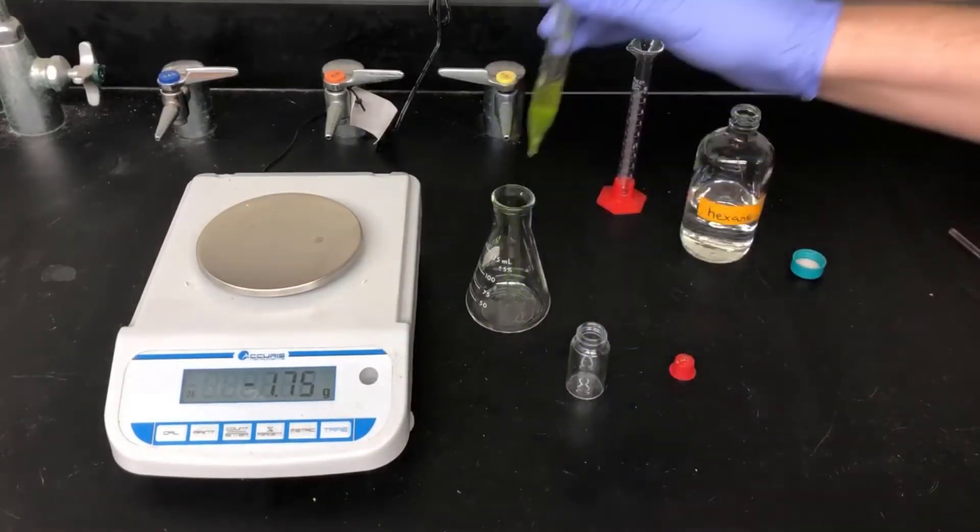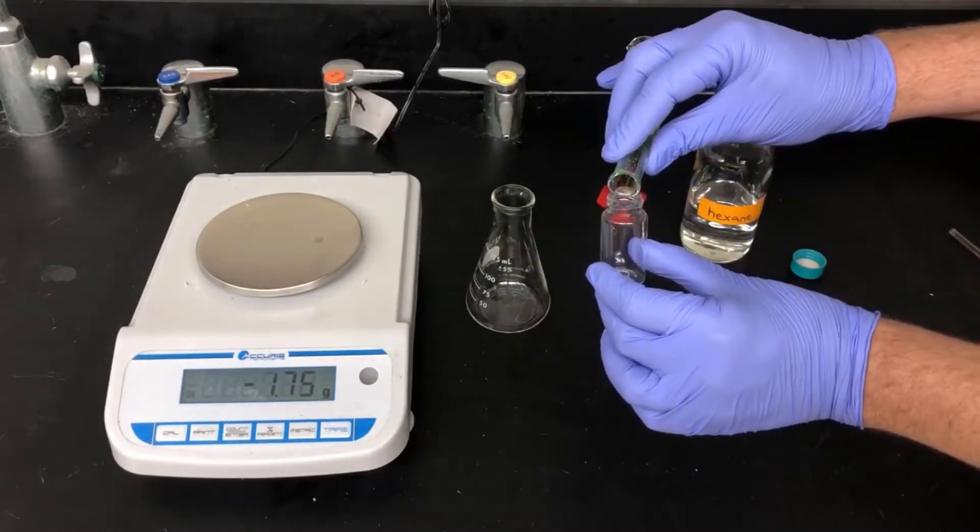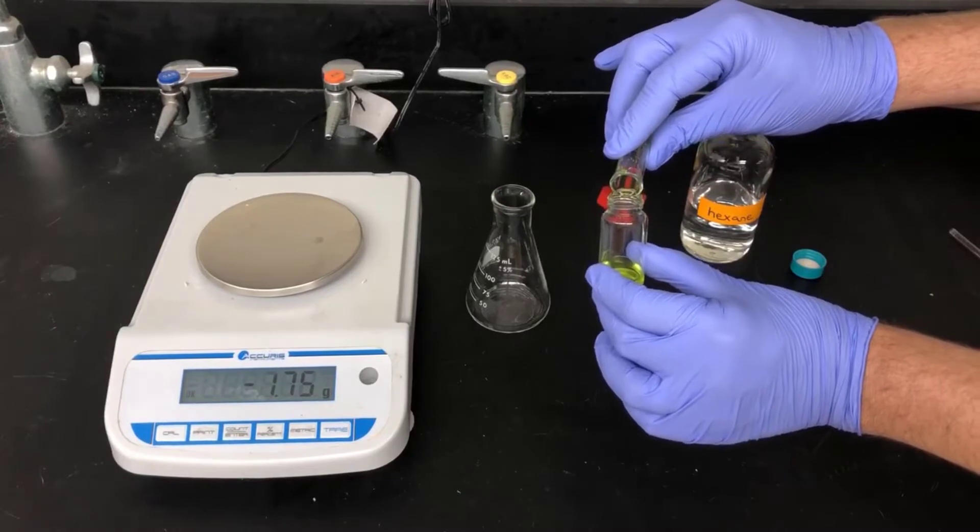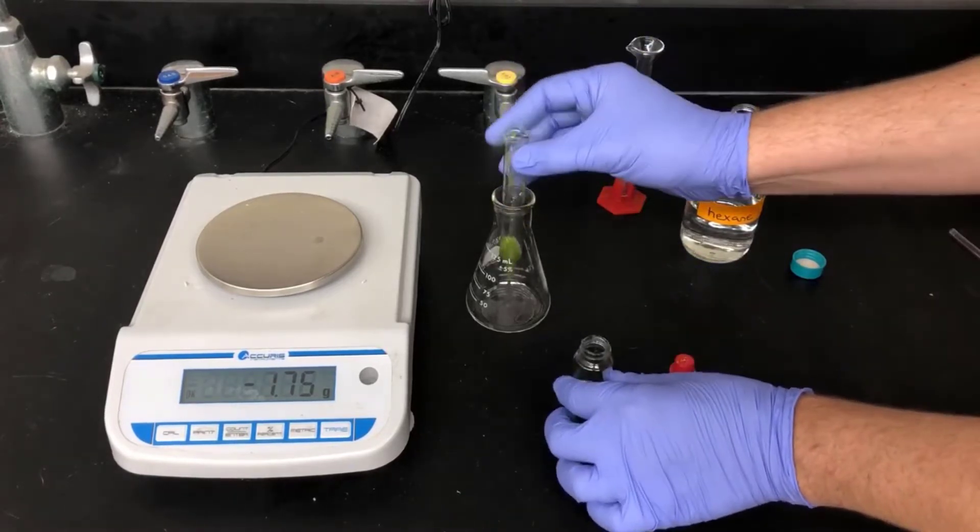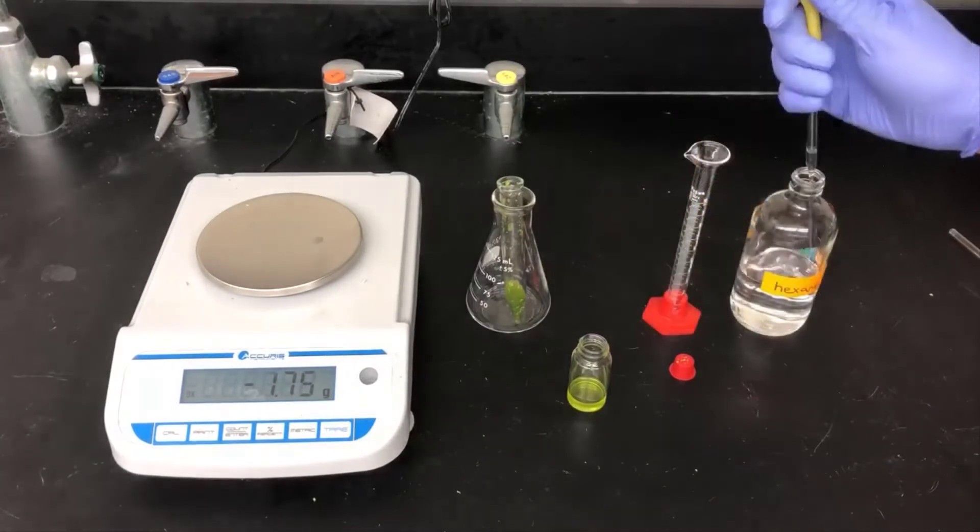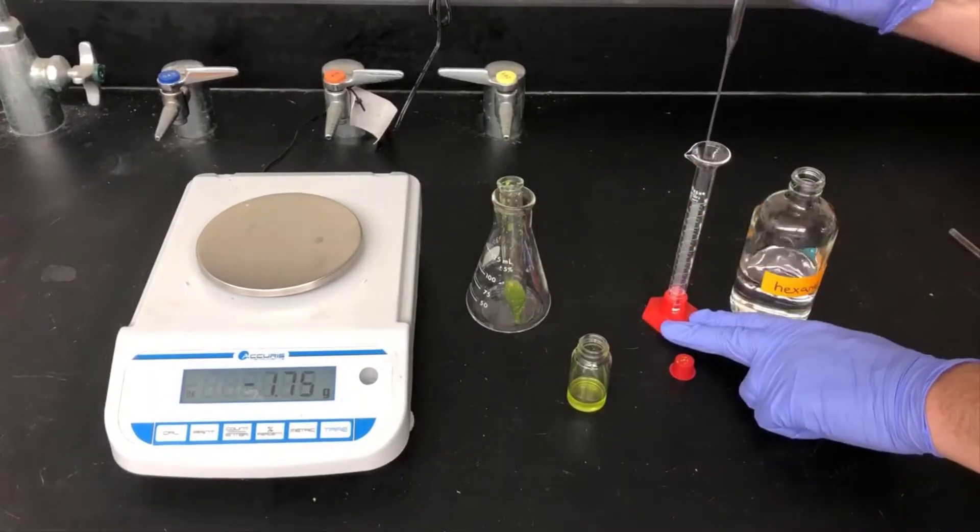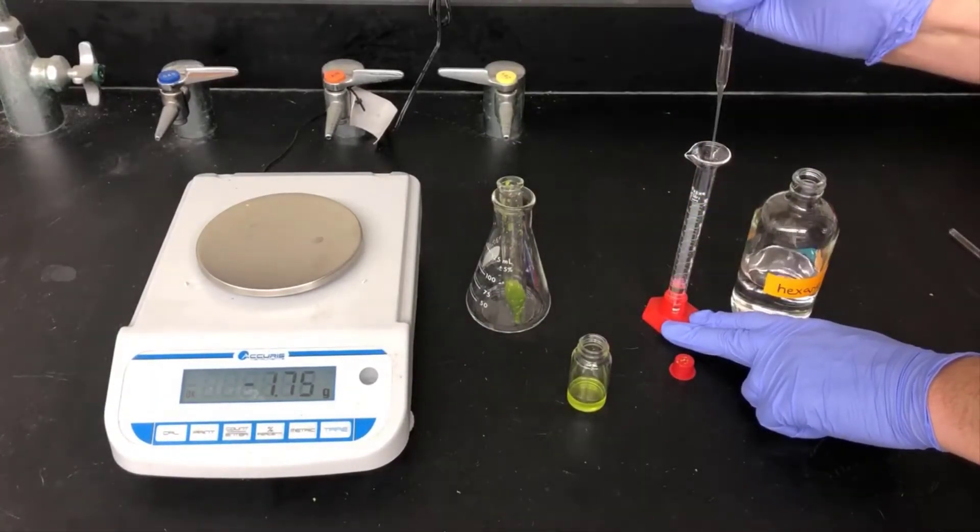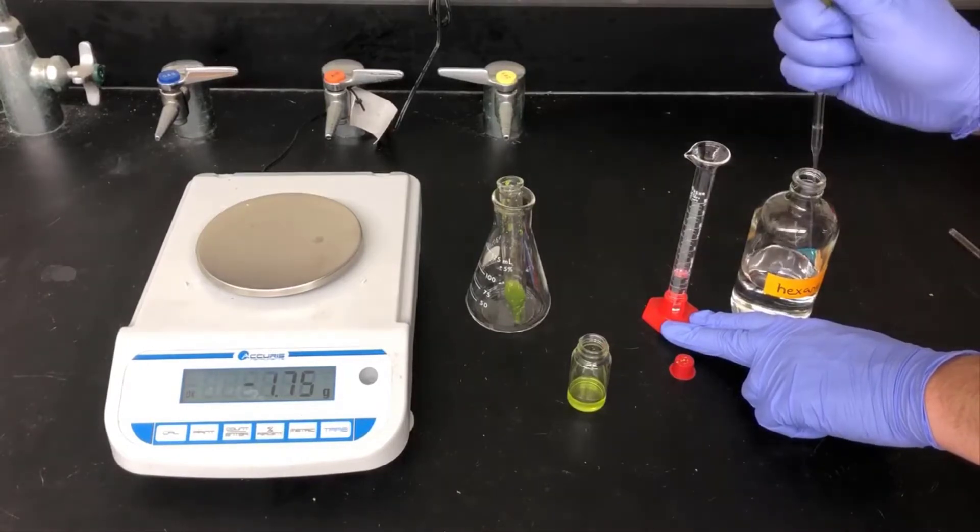I've got a clean dry vial here, which I'm going to decant the solution into. I'm pouring carefully here to leave the citrus peels behind, but get the hexane solution out. Next, I'll measure out another 6 milliliters of hexane and then add that back to the citrus zest. The idea with doing a second extraction is I'll get more of the essential oil.